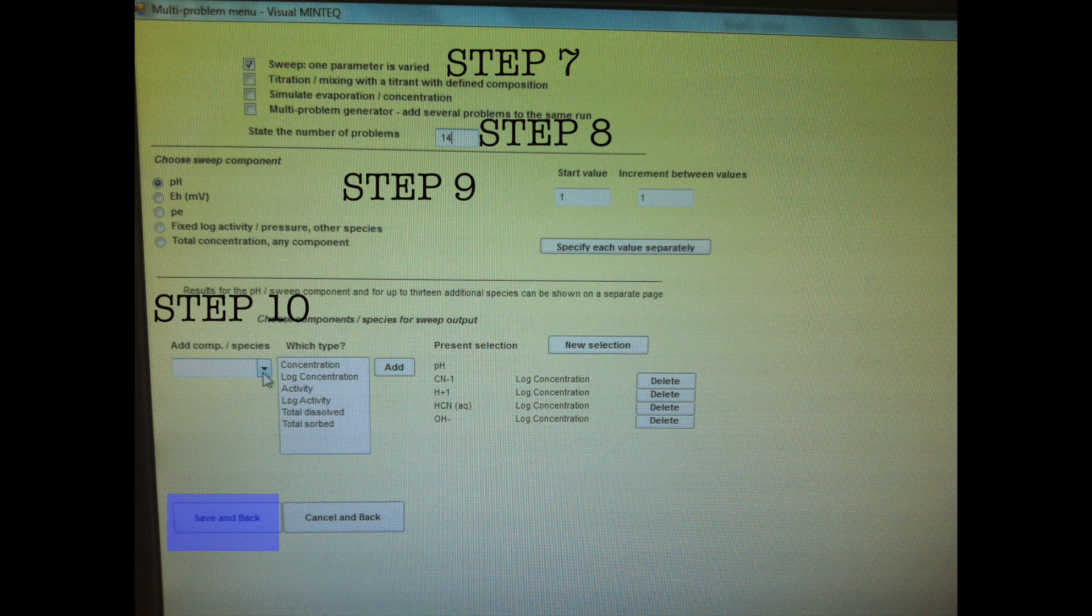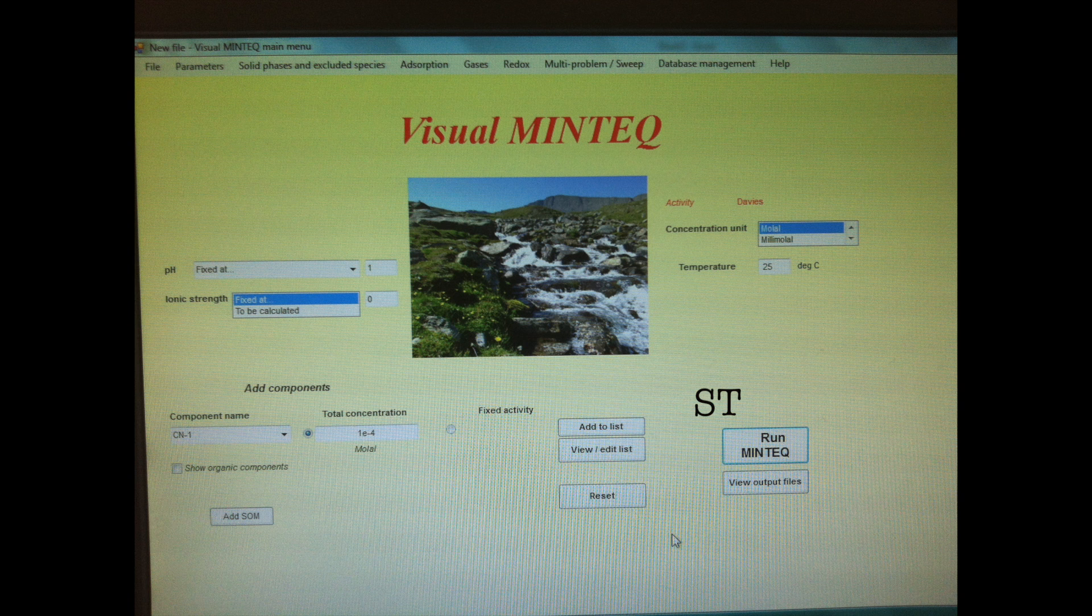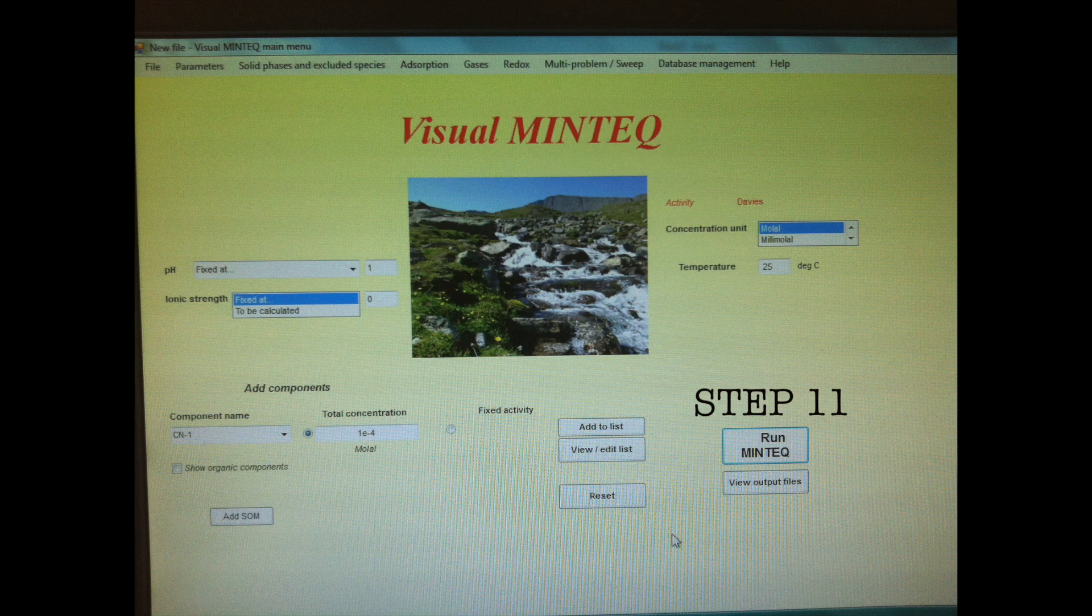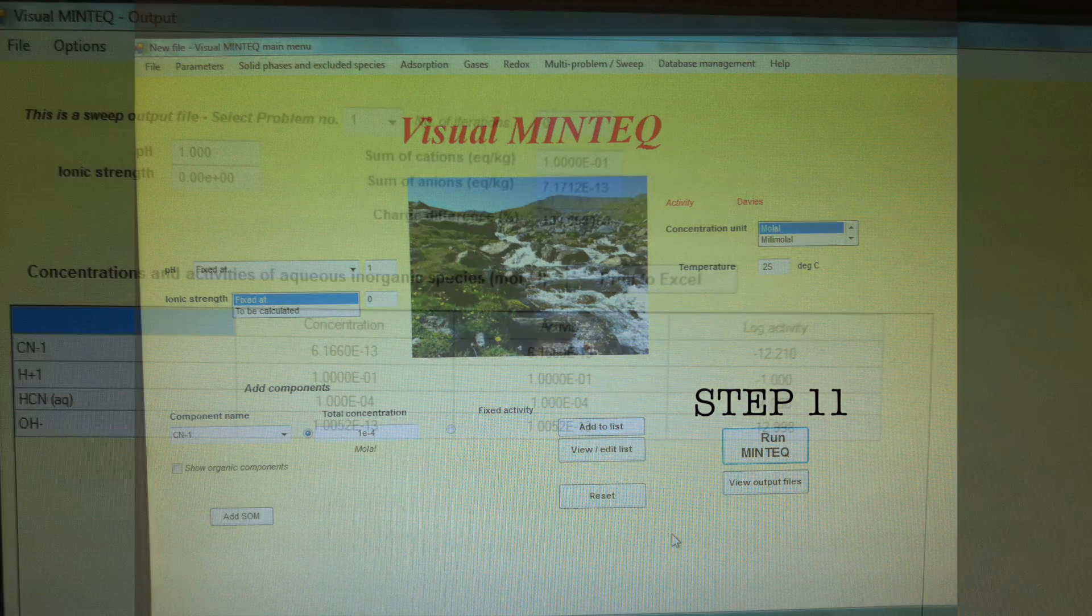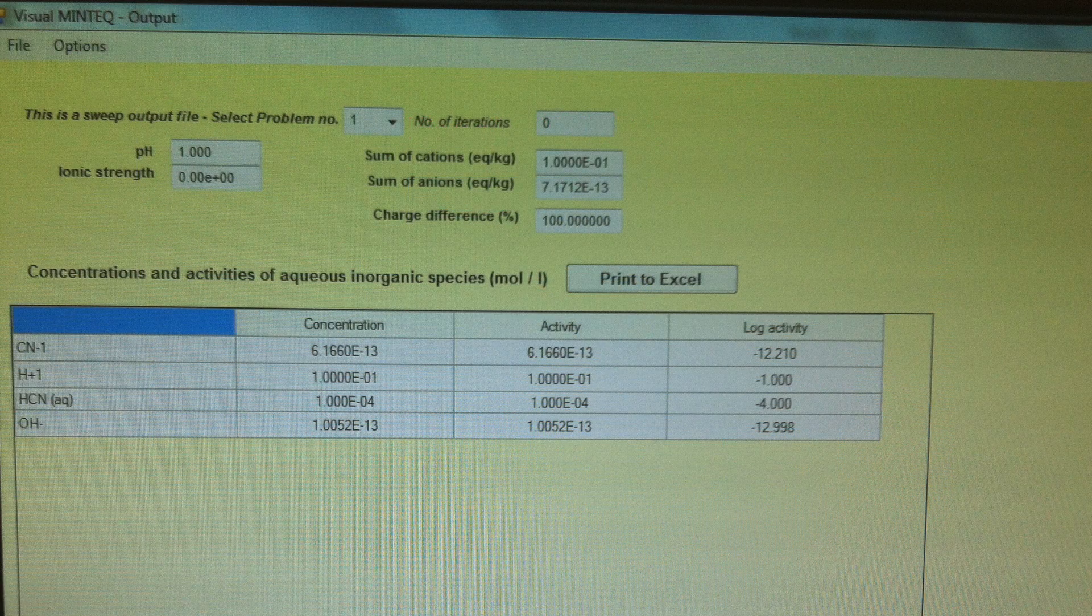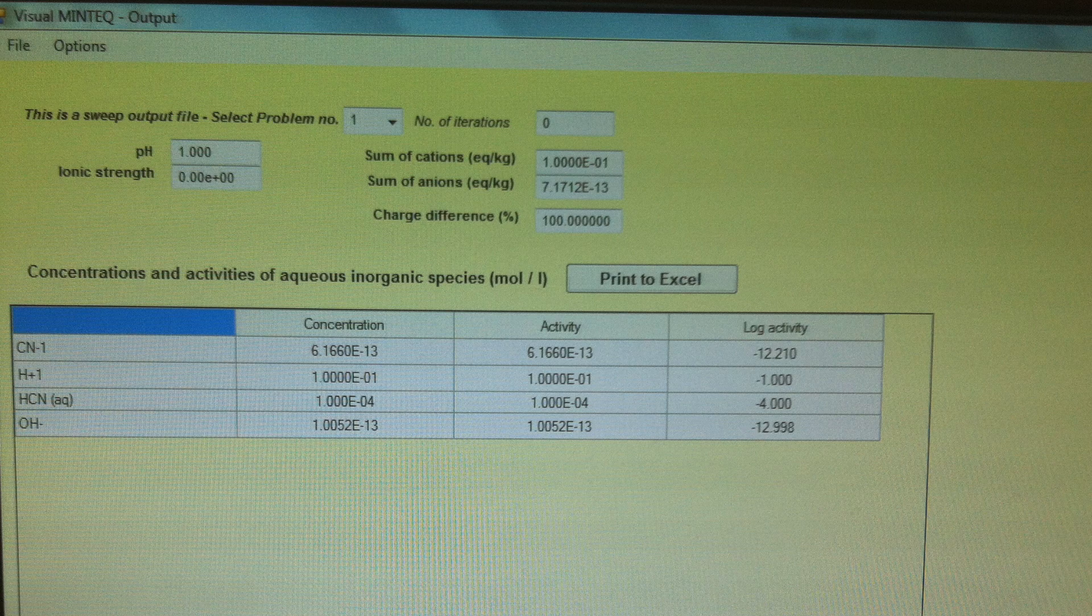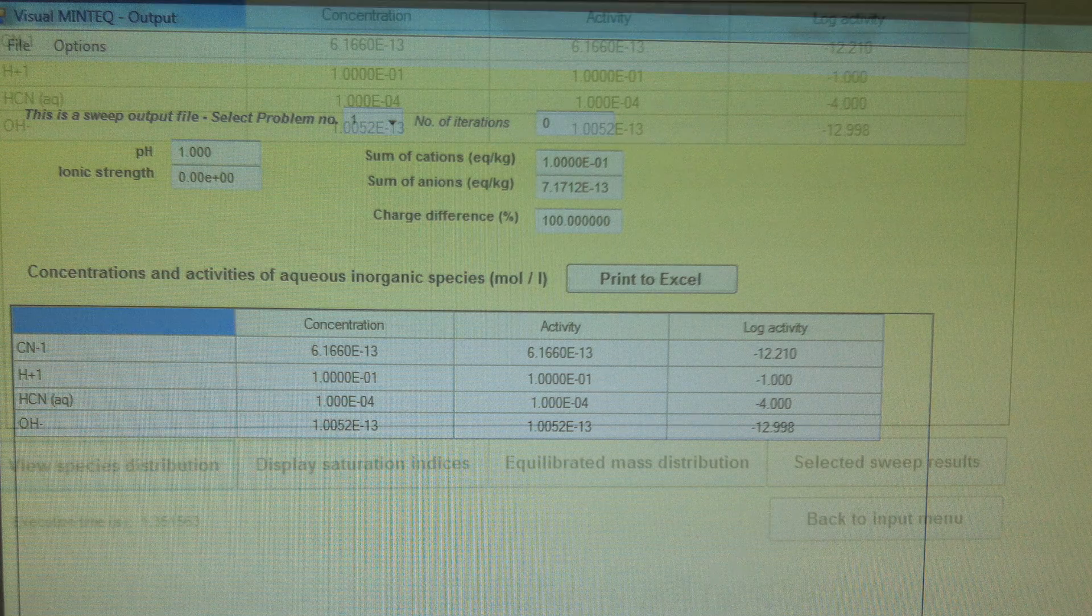And now let's run our program. Here's our output screen at our first iteration point, so it's pH 1 showing my concentrations, activities, log activities for the various species.